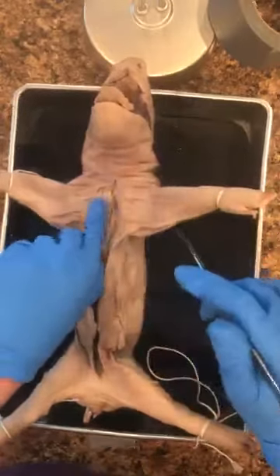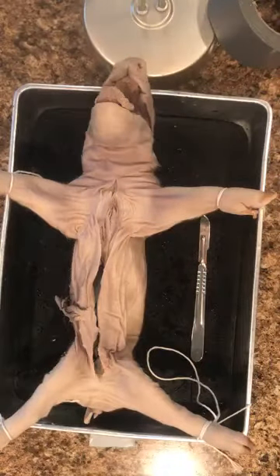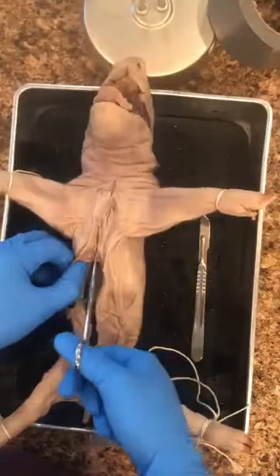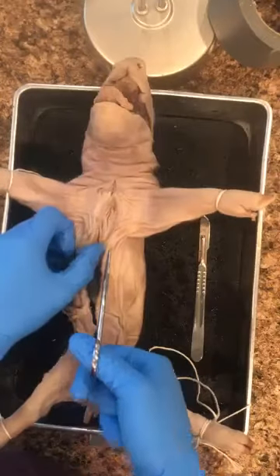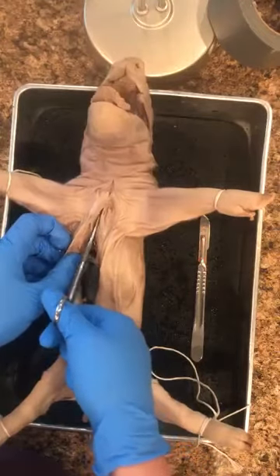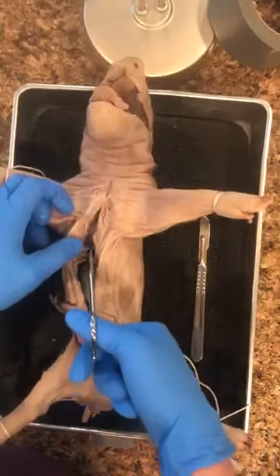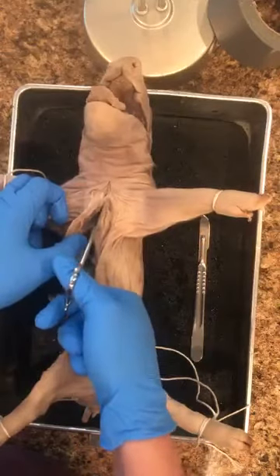Okay, I'm at the point where I need my scissors. In the sink. Because I have to cut through the sternum, which is up here. Cutting the pericardium. It's okay, it's that covering for the heart.